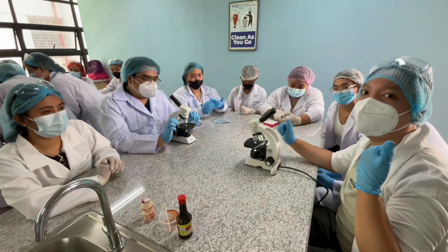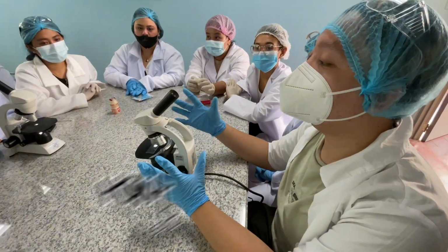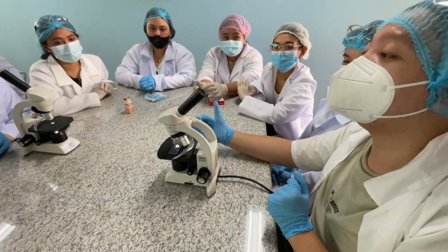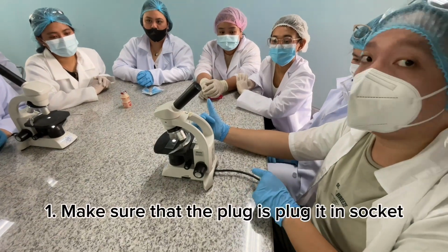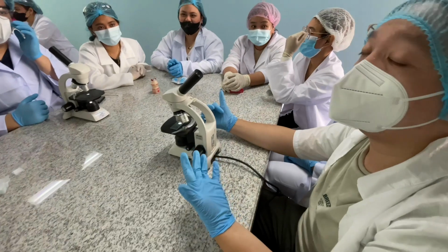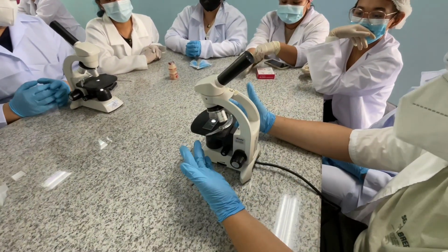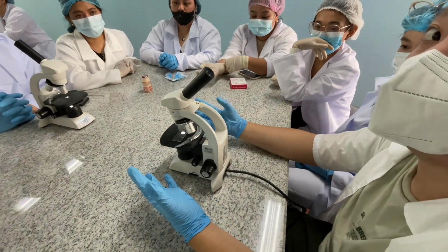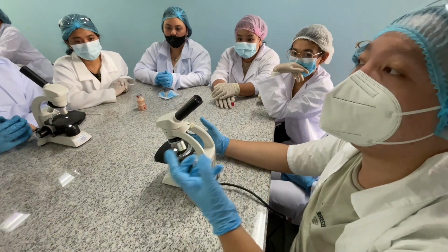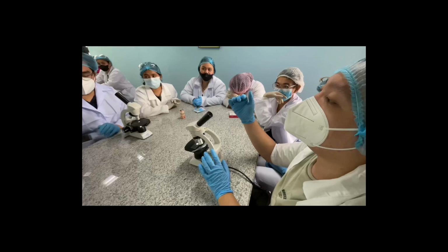So let's begin. Alright, now that we have our specimen in place, I'm going to teach you how to use our microscope. As you can see, this is our electronic microscope. First thing that we're going to do is make sure that the plug is plugged into our socket so that we have power. And then make sure as well to turn it on, because it may look as white as possible, but sometimes it is not turned on. It's important to make sure it is on because we need light to make our specimen visible. Now, let's move on to our parts.